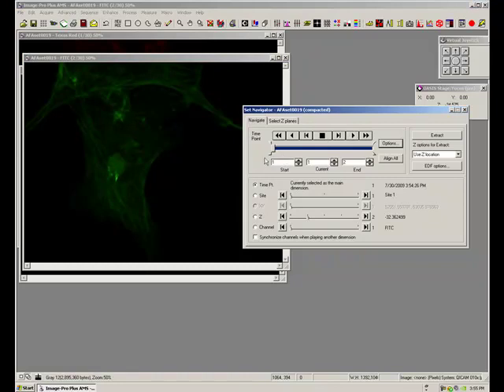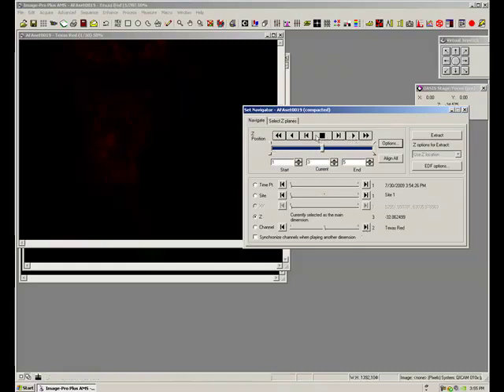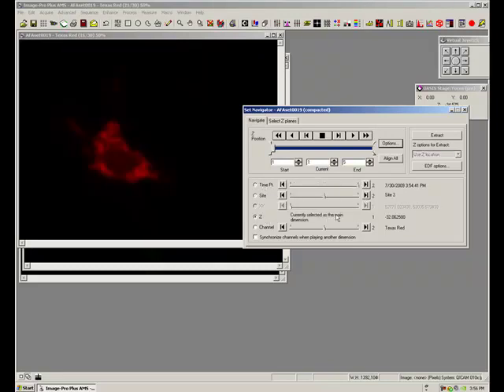You can see this is on my bench in my office, and not much happens in 2 time positions. I can look at Z. Maybe I just want to extract that channel, or maybe I want to extract this channel out as well. Either way, I can navigate my way around. I can look at time point 2, site 2, at Z position in the middle. Glorious, lovely image.